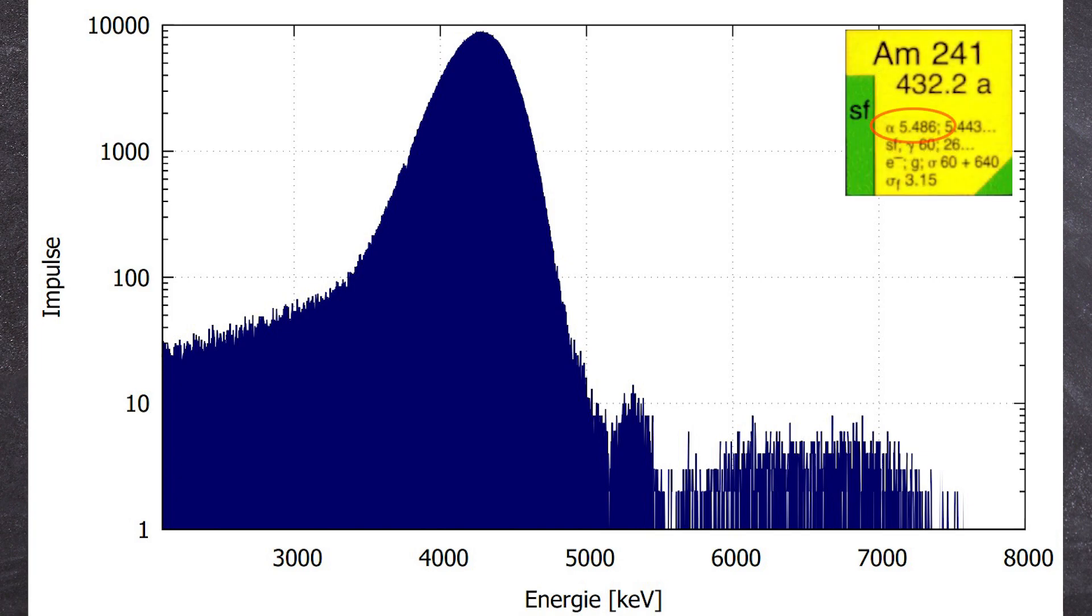Normally you would expect a very sharp peak at 5486 keV but this peak is extremely broadened and shifted by about 1 MeV into the low energy range. This is a clear indication that the active material is covered by something shielding it.